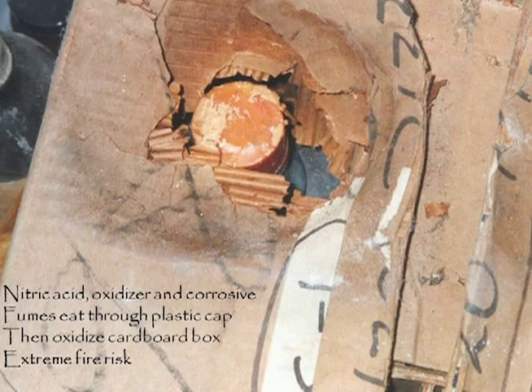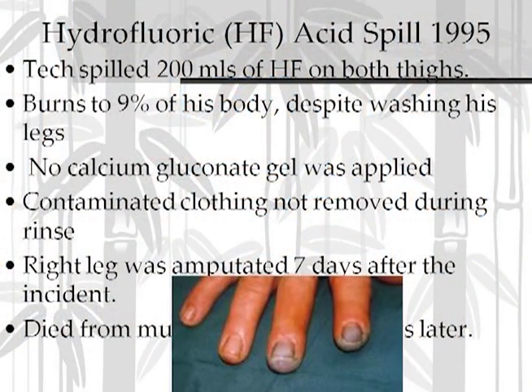The acid that we're most concerned about in schools is hydrofluoric acid. Hydrofluoric acid should always be in a plastic bottle because it dissolves silica. So it dissolves glass. If you transfer hydrofluoric acid, which is a clear liquid, into a glass bottle, you'll have a puddle of clear liquid on whatever counter or shelf it was on. It looks just like water. However, if you touch it with your bare hand, there's a very good chance you'll lose any fingers that came in contact with it in a very short order.